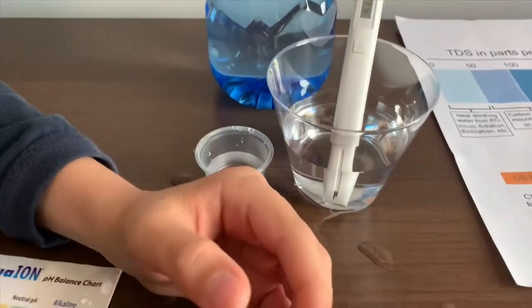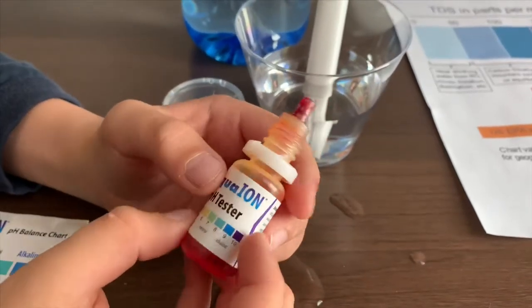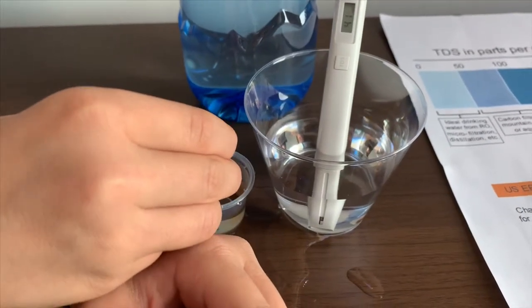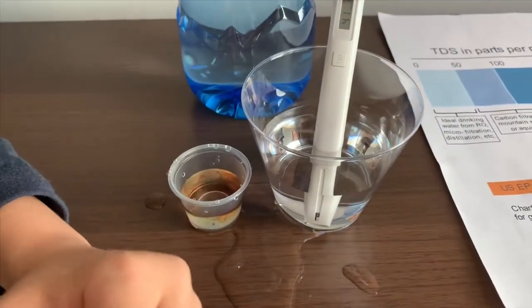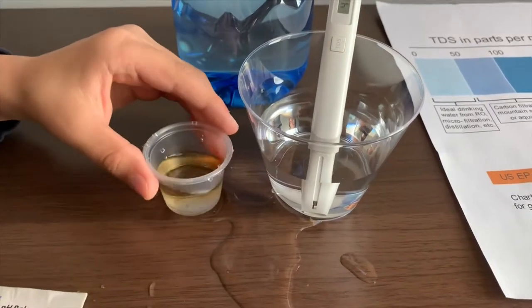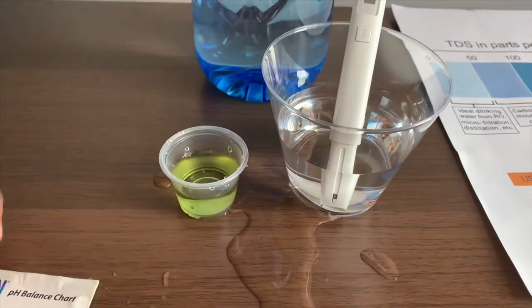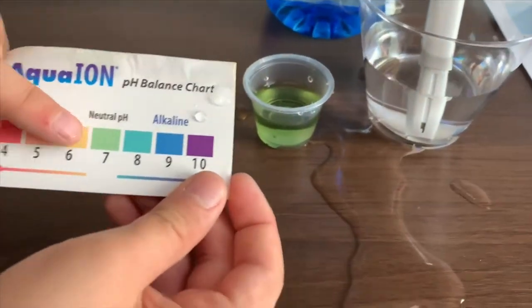If you want to buy this pH tester, check the link down below. Only do two drops. Let's stir it a little. I give this a 7 — this is neutral pH.